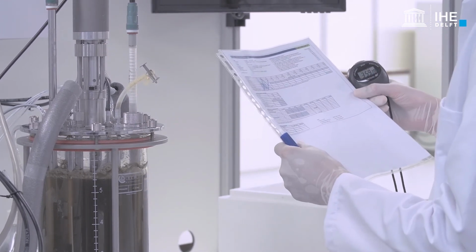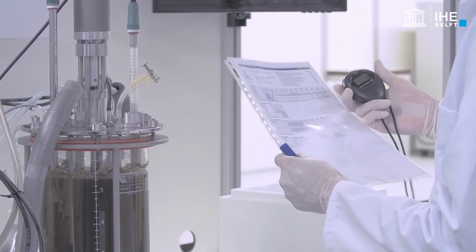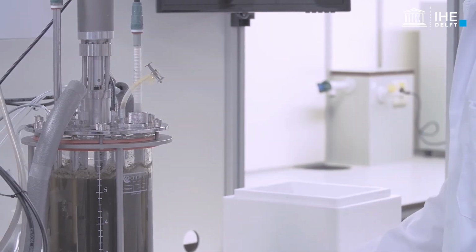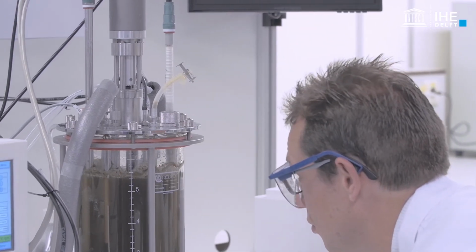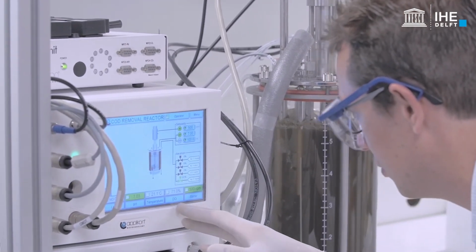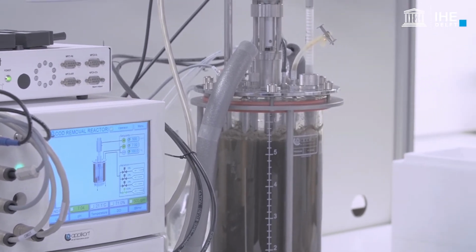After the addition of the carbon source solution, confirm the times of the sampling program. Arrange the required sampling material and continue with the collection of the samples as planned.